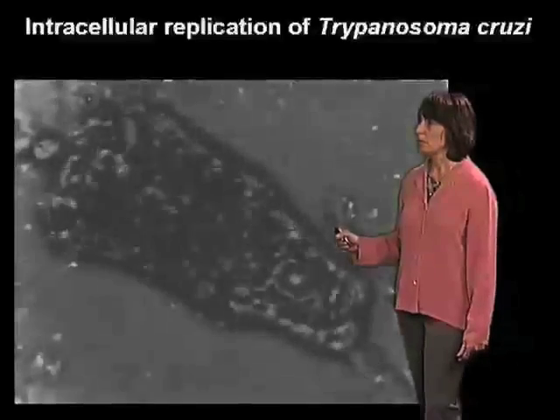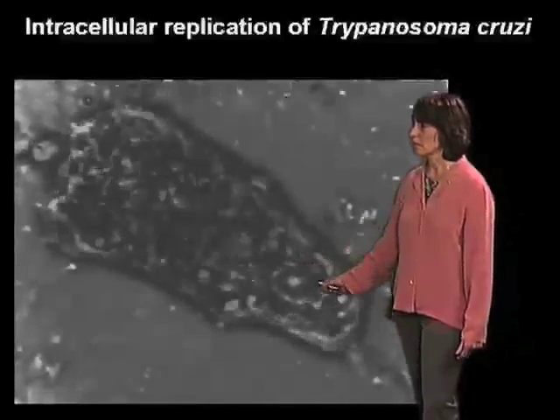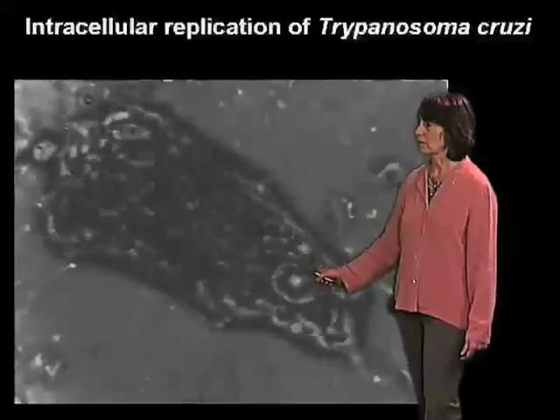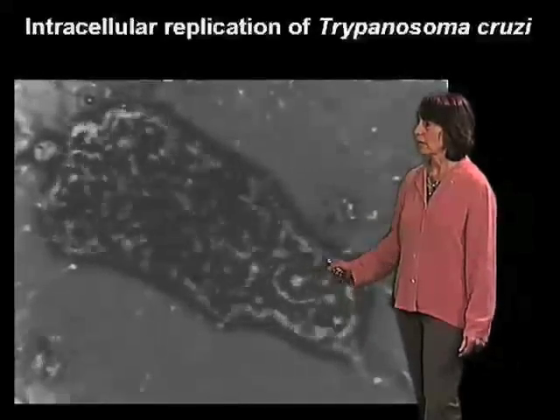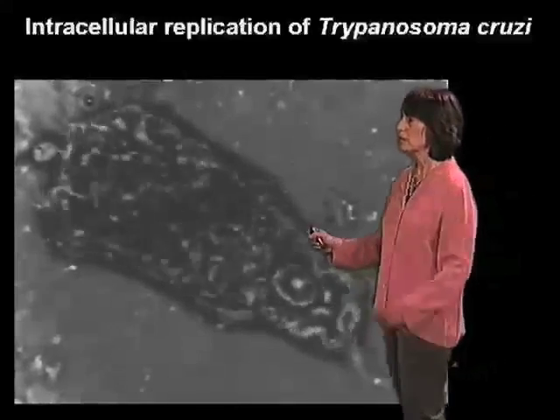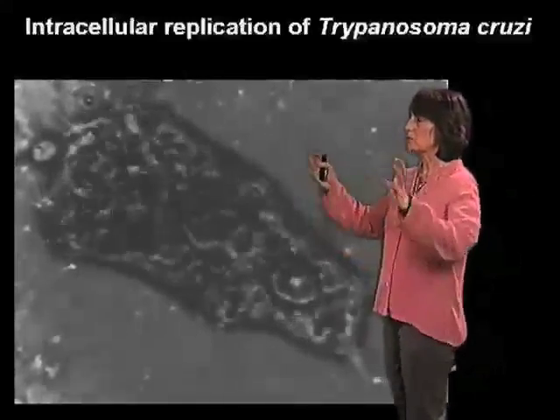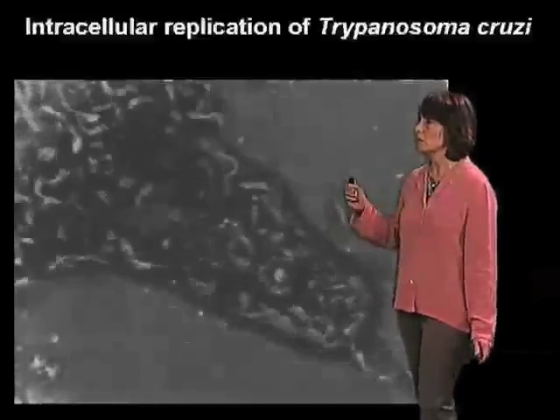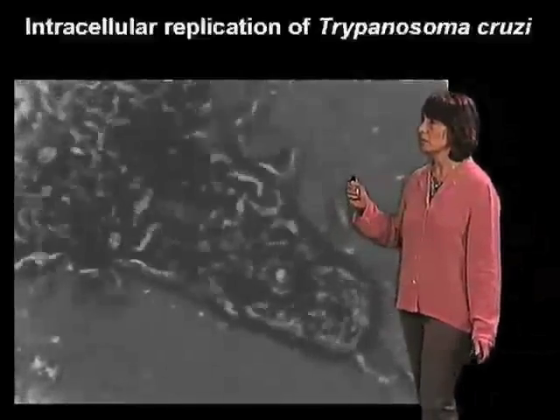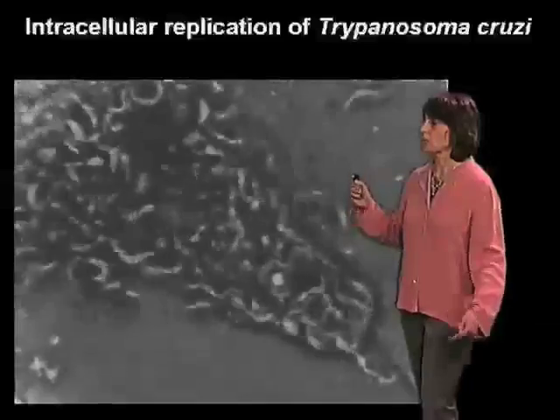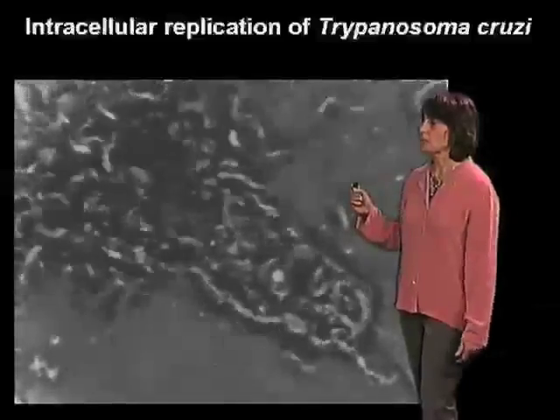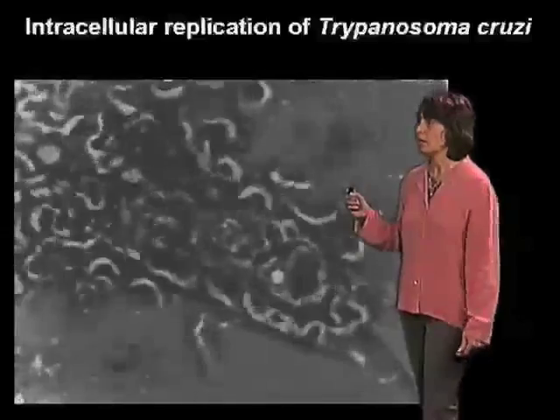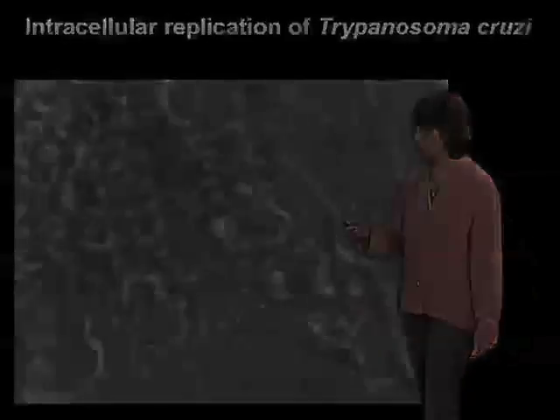We're going to be able to see in this cell that the nucleus is already quite degenerated, and we're going to be able to see the moment in which the plasma membrane breaks down and these parasites are released into the medium. This is how they reach circulation, and they can then be taken up by the insect during a blood meal.